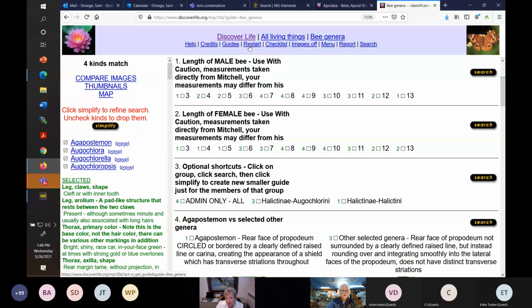Different people have different ways of thinking about everything. So some people are like, I'm in the trenches, I'm just going to keep digging. I'm just arguing that it's way better to flit around and look at a lot of specimens and put them down and not worry initially about feeling like you nailed the identification, because nobody nails identifications initially. So it's better to gain a broad experience in looking at lots of specimens and lots of species, and then coming back and redoing them all again.